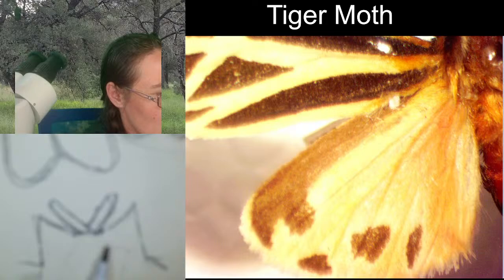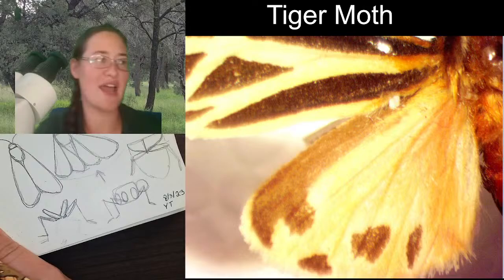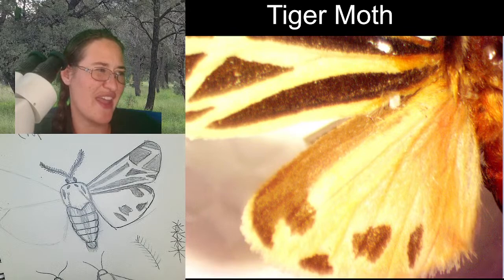So, it would be like a little slice of pizza here, and that's where the femur comes up out of. It's not going to be very big at all. It's practically not going to be visible while the specimen is flying around.